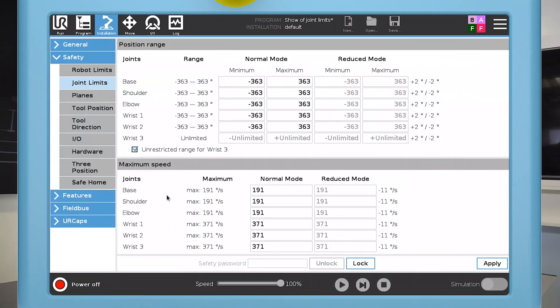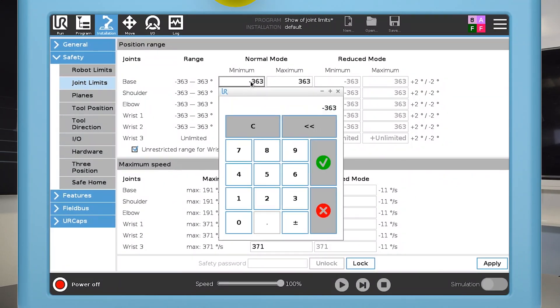Next, I'll limit the range of the base joint so it can only move within the range required to run this program.